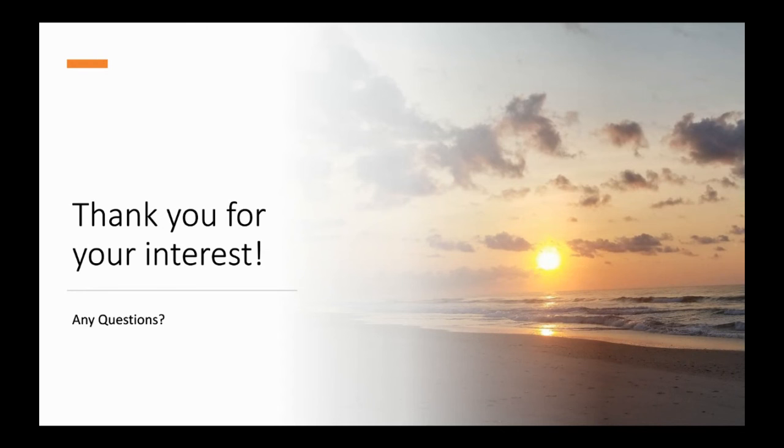Other questions? I see Carlos has one up here. You can also use an IR instrument to do that. Yes, he's right. You can also use the IR instrument to do that. And we also have the LC instrument that you might be able to do that with as well. So there are a number of analytical pieces of equipment, Mark, that we can maybe use to do that analysis.